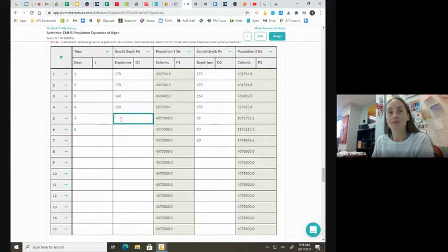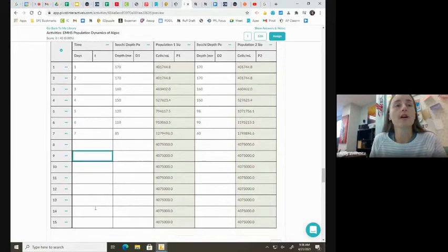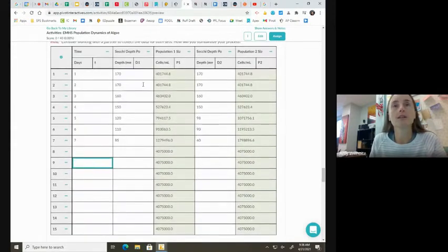And then this one was the low nutrients. So perhaps we didn't see as much growth as quickly. Okay. Let's have some good growth on this one. Basically that's how you'd fill out the whole table until you got through day 15. And that's what you would do there.